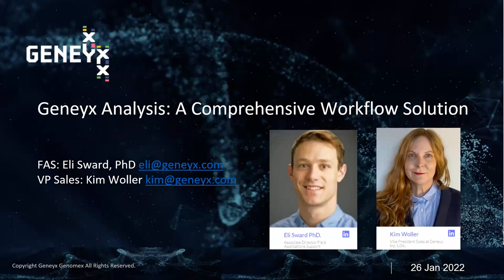Perfect. Thanks for that introduction. As Kim mentioned, my name is Eli Sward, and today what I'm going to be talking about is the Geneyx Analysis platform and really how this is a comprehensive workflow solution for your bioinformatic pipeline.